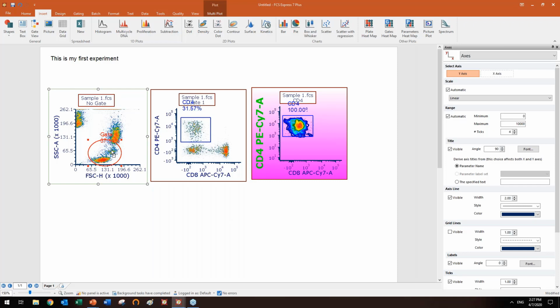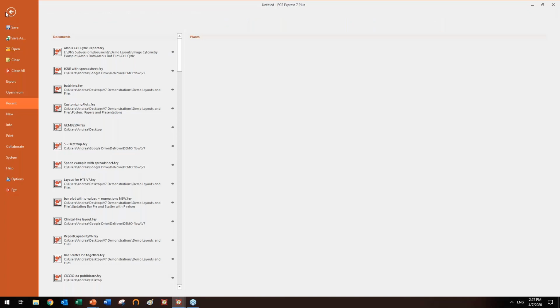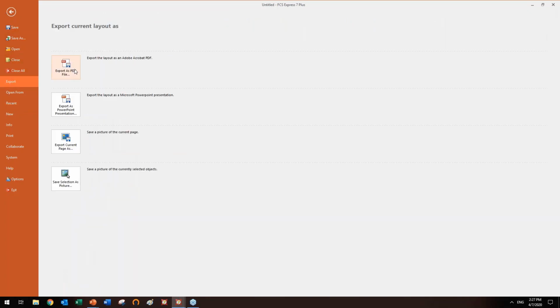Otherwise, you need to go back, open the layout of your software, change, and then export to PowerPoint, and then go to your boss. But if you still want to export to PowerPoint, that's fine. Remember, here in the File tab, this is similar to any Microsoft Office package. We have export. So for example, in PowerPoint, you can export to PDF. We can export to PDF too.